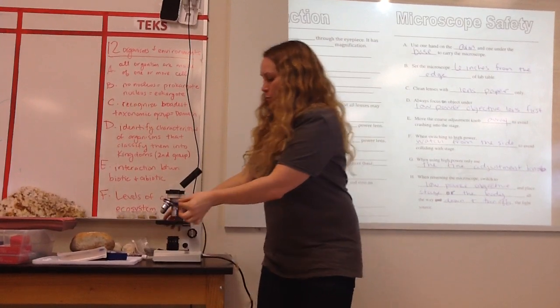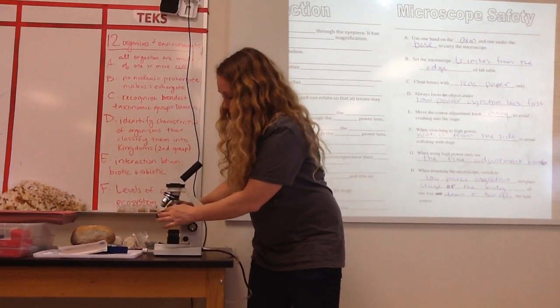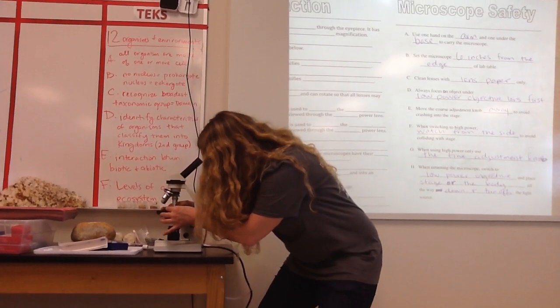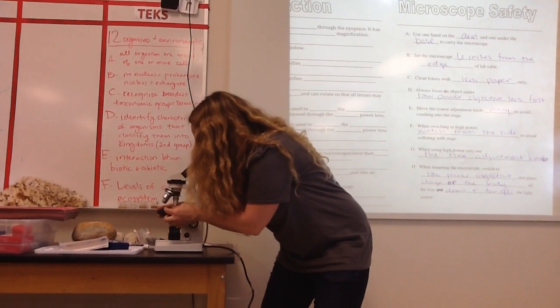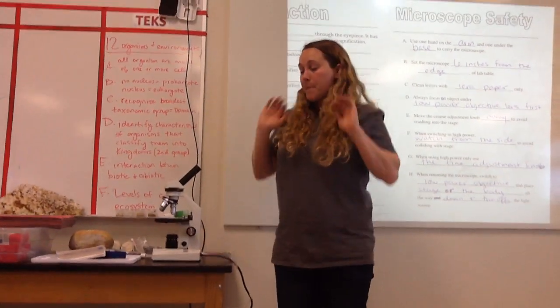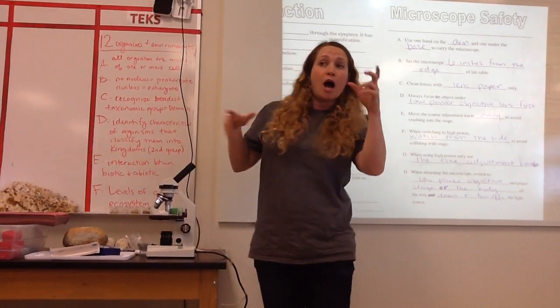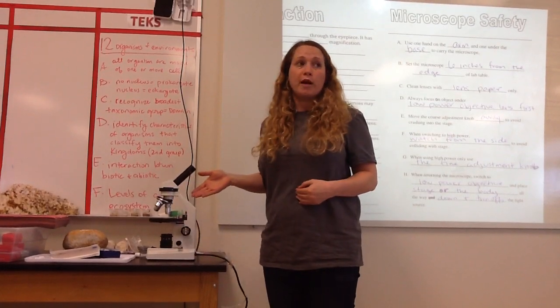So you take it, you put it under the little clips. They're called stage clips. You have to lift them a little bit. Make sure your little object goes right in the blank spot where there's a piece of glass. It's kind of hard to see. There we go. Boom. So I haven't focused it, so I won't be able to see the image well, but when I look in, I should see a blobby out of focus something. It was blue on the slide, so it should be blue when I look in.